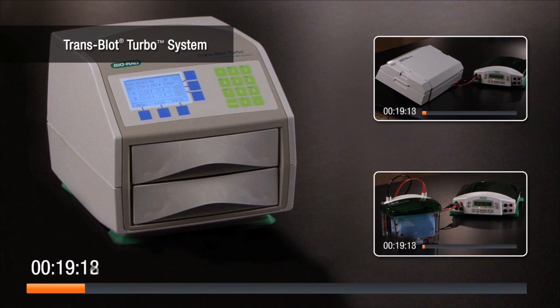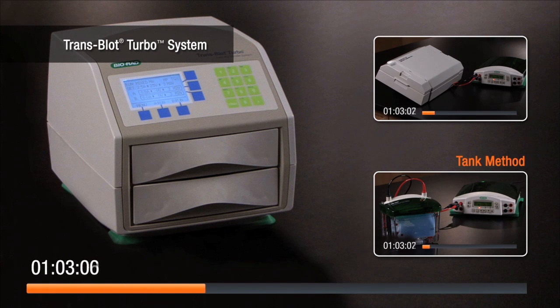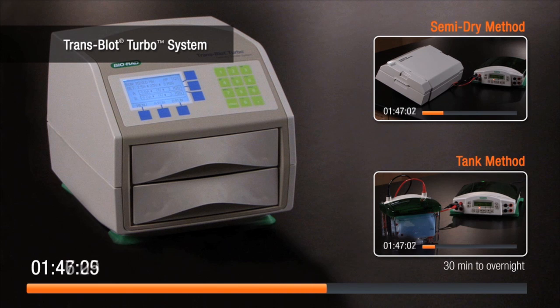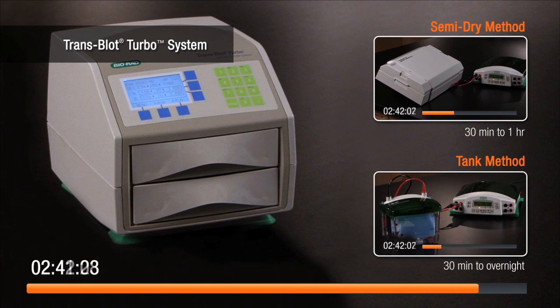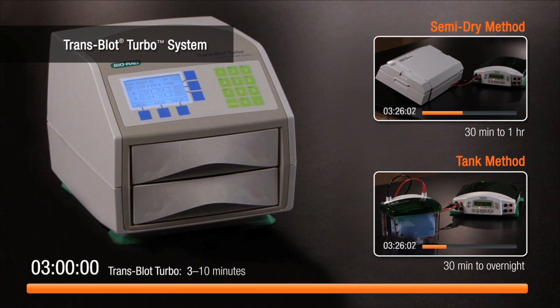These three systems differ greatly in the transfer time required. Wet tank transfer typically takes from 30 minutes to overnight, whereas traditional semi-dry transfers take 30 minutes to an hour. BioRad's new Trans-Blot Turbo system transfers BioRad's TGX gels in only three minutes, with most other gel types, the system transfers proteins in seven minutes.